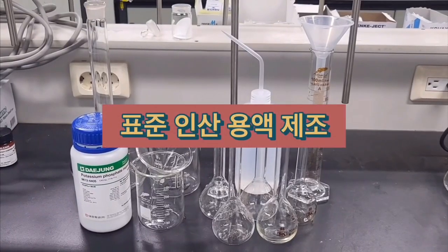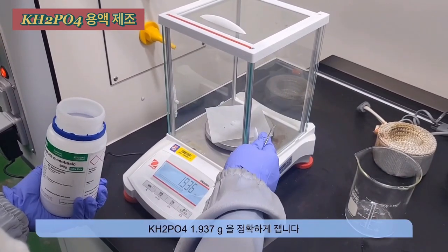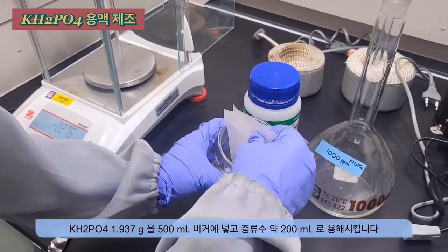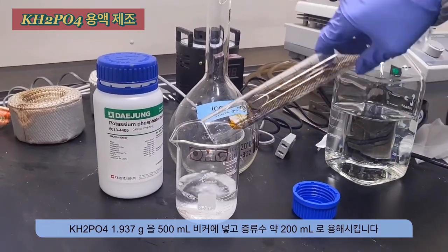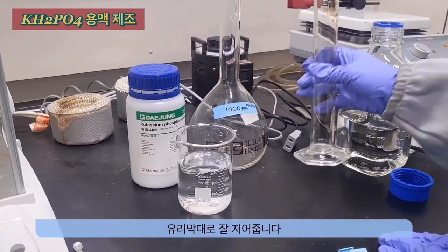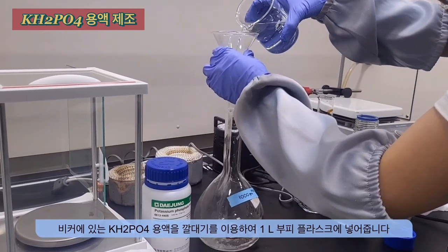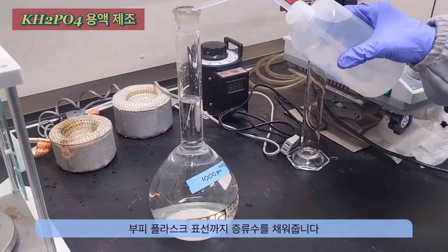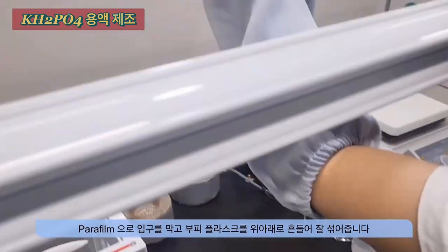Here is the process for preparing a standard phosphate solution. Measure precisely 1.937 grams of monopotassium phosphate and transfer it into a beaker. Dissolve it with distilled water and stir well using a glass rod. Transfer the solution into a 1 litre volumetric flask and fill up to the calibration mark with distilled water. Cover with parafilm and shake to ensure thorough mixing.